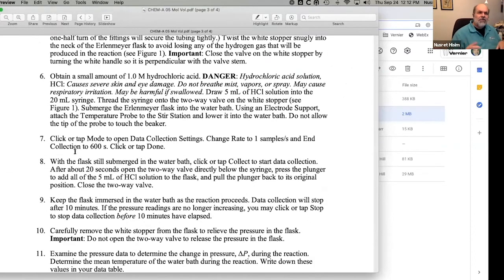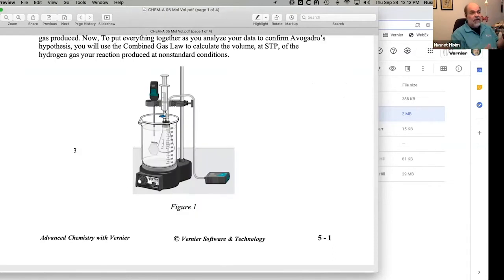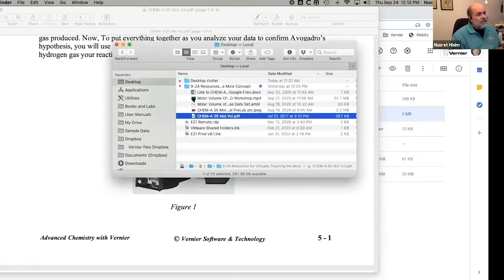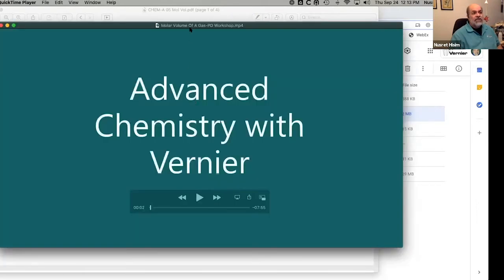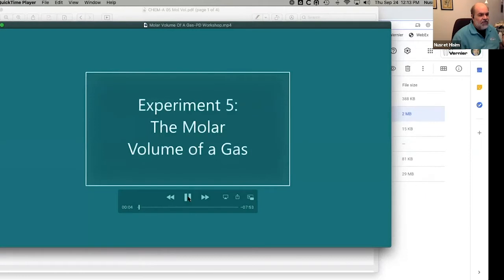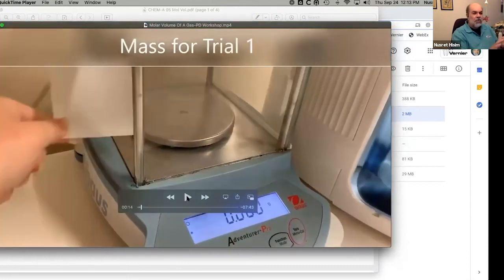What if it's not possible for your students to actually do this experiment? What we did was Melissa took a fantastic video of the experiment. The video is in that shared folder we're encouraging you to look at. We also collected data to go along with it, so let me start the video very quickly so you get a feel for it. There is the volume of the flask determined from mass. Let's make this as realistic as possible — in the classroom, students would have the equipment set up and be collecting data.